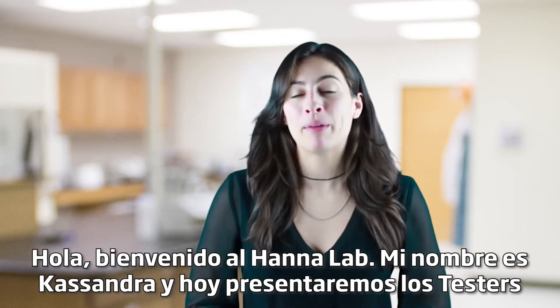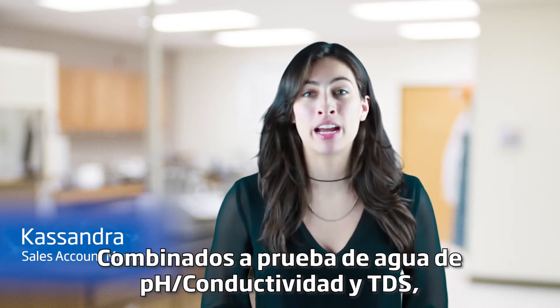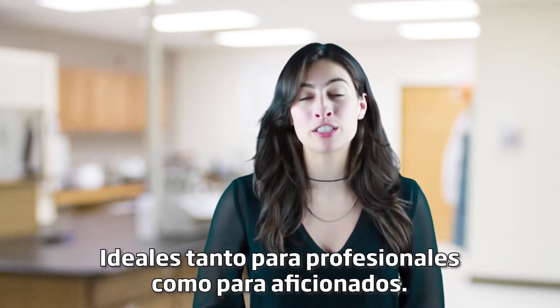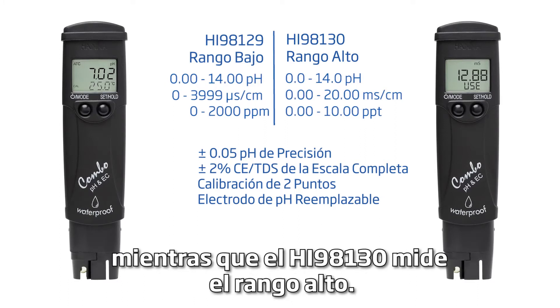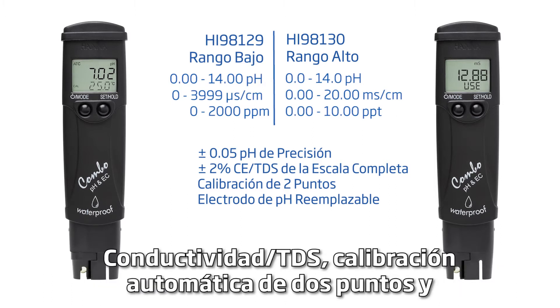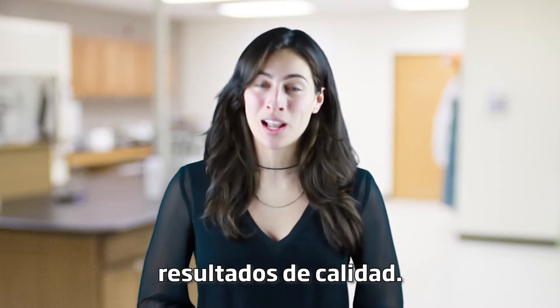Hi and welcome to the HANA Lab. My name is Cassandra and today we'll be featuring the waterproof HI-98129 and HI-98130 pH, conductivity, and TDS combo testers, ideal for professionals and hobbyists alike. The HI-98129 measures low range conductivity and TDS, while the HI-98130 measures high range. These testers have an accuracy of plus or minus 0.05 pH, plus or minus 2% full-scale conductivity TDS, automatic two-point calibration, and offer a replaceable electrode — all for $150.